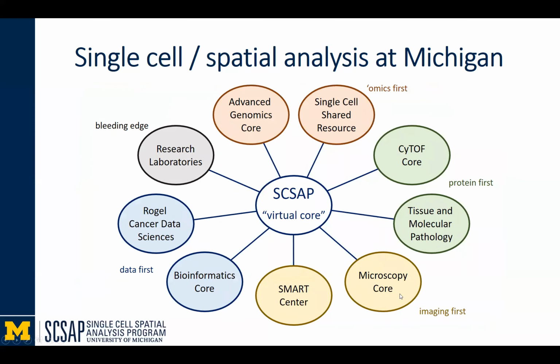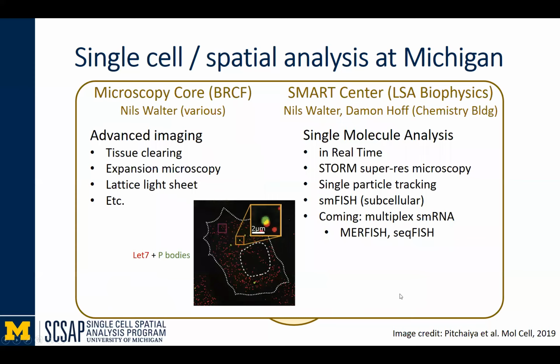So let's now move to imaging-first technologies and two core facilities that are both co-directed or directed by Nils Walter. The first is to just quickly mention the microscopy core. So of course, spatial analysis is in some very real sense imaging. So core facilities like Nils's that have a focus on advanced imaging technologies are going to be very relevant.